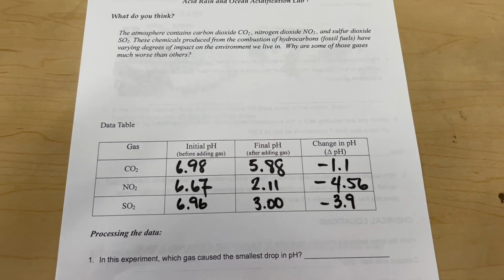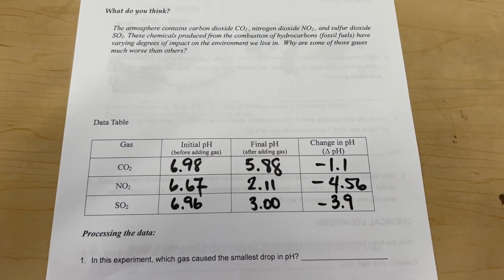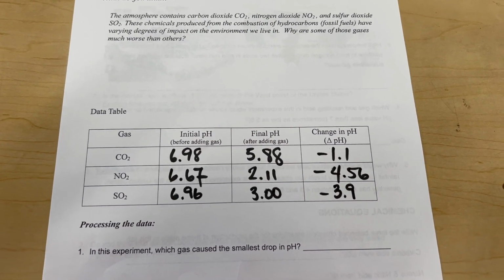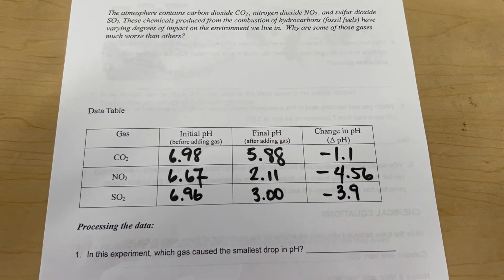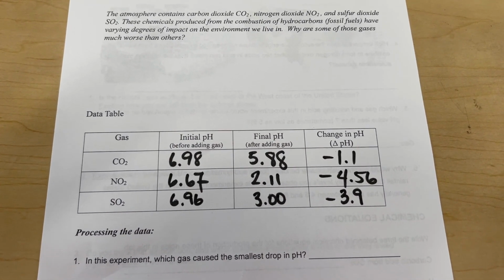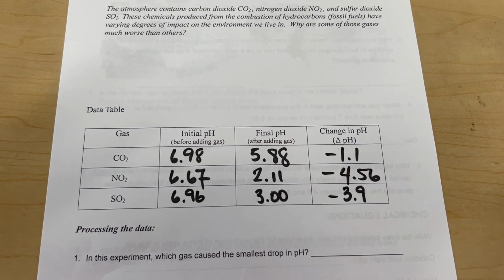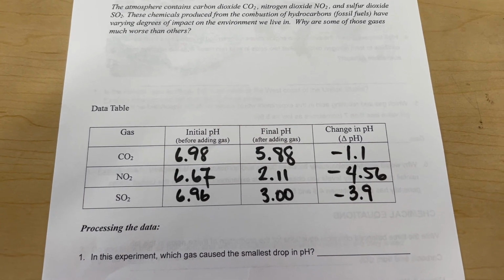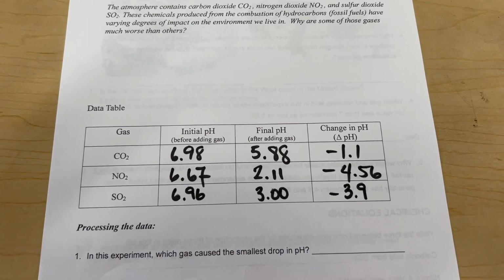Well, here we have it. As we can see from the results in our experiment, the effect of these three different gases is quite a bit different on the resulting pH of the water once they are dissolved.